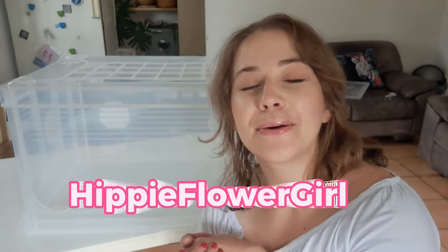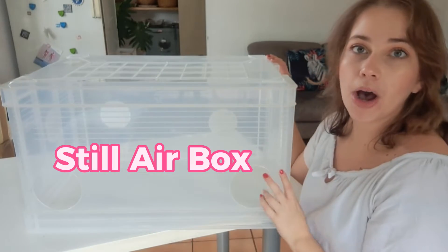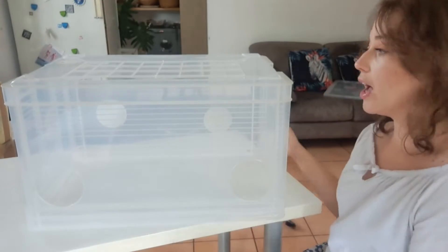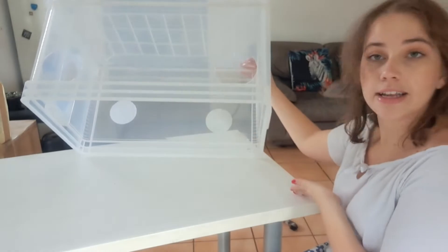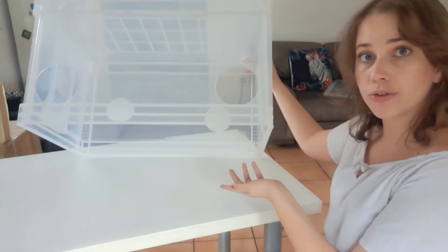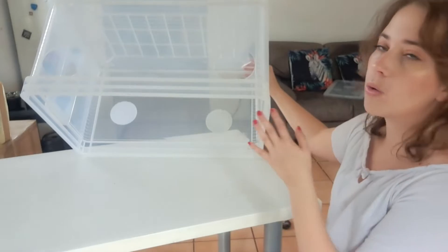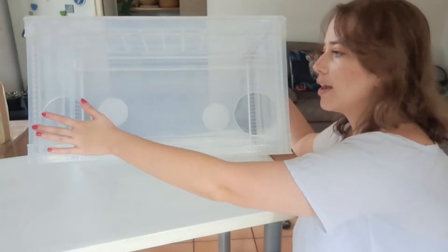Hello everyone and welcome back to Hippie Flower Girls. Today we are going to talk about our still air box, or SAB for short. This is my still air box — it is just a plastic container without a lid. They didn't give me the lid when I ordered it, so if you have a still air box with a lid, please let me know how it works. I've been thinking about upgrading my still air box, and then it has two holes in here for your arms.